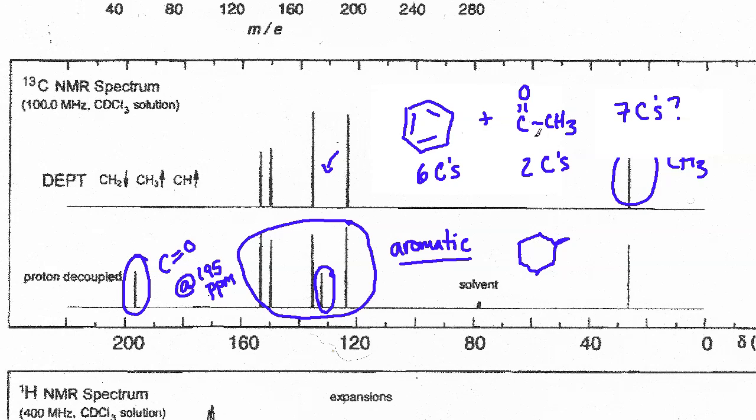It wouldn't come from the acetyl group. That wouldn't make sense. But I could cut one of them out from the aromatic group. However, I would have to replace it with another atom instead of carbon. So these are what's known as hetero rings. For example, maybe you have something like an oxygen that goes into a ring like this and takes the place of one of the carbons. A lot of students have seen this, like cyclical ethers and things like that.